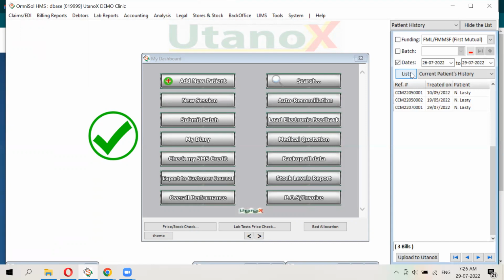Okay. Then the next question. Okay, we said EDI. Yes, we do.